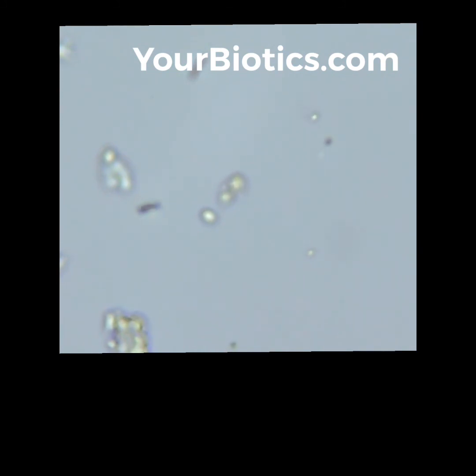These archaea microbes are just full of energy and they're the key to the microbial world. They bind and do work with the probiotic life to help out multicellular organisms, such as plant cells, human cells, or animal cells. They all work together and everything needs to be there. The key here is the energy. As time goes on, it'll just keep getting bigger and bigger as the cells grow.